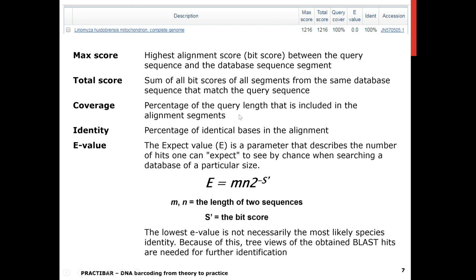Coverage is the percentage of the query length that is included in the alignment segment. Identity is the percentage of identical bases in the alignment. Then you have the E-value, called the expect value — that's a parameter describing the number of hits one can expect to see by chance when searching a database of a particular size. The E-value is derived from the bit score.